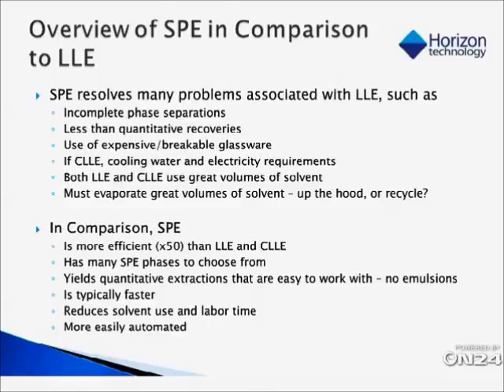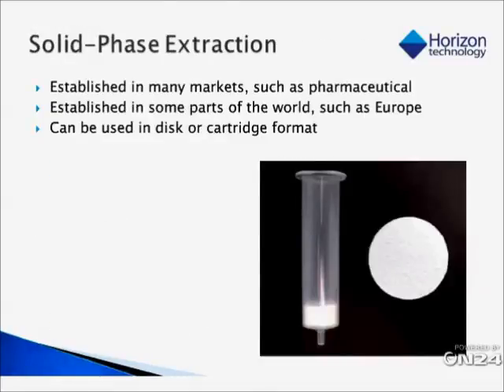Solid phase extraction is established in some markets, and we heard from the other speakers today that in the pharmaceutical market especially, you see a lot of use of solid phase extraction. And it's established in some parts of the world, and I think Europe is ahead of the U.S. in this regard. Now, it can be used in disc or cartridge format.